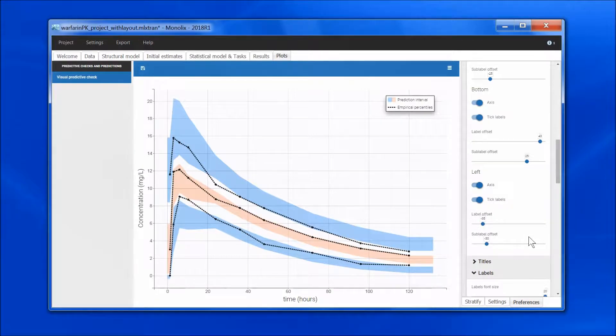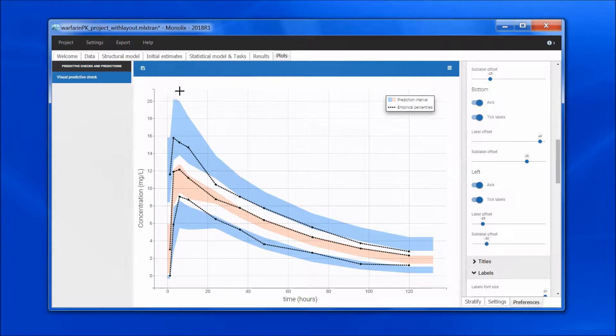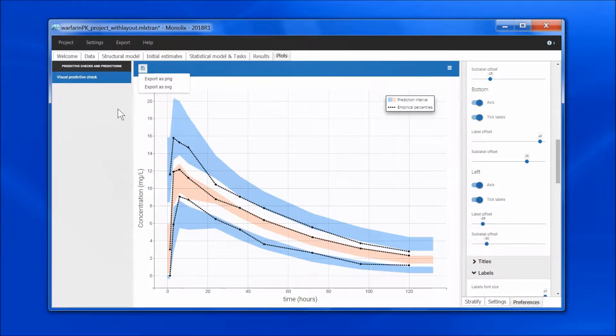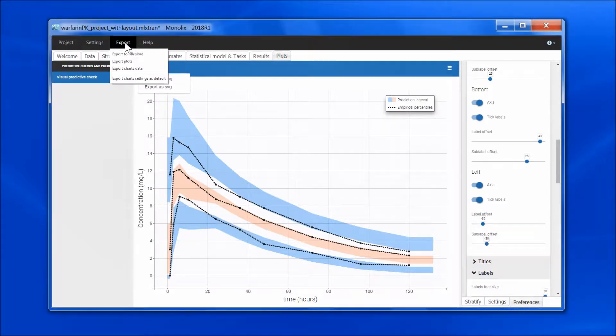When I am satisfied, I can export the figure. I can click here and export as PNG or SVG file. If I want to export all figures at once, I can go to export, export plots.